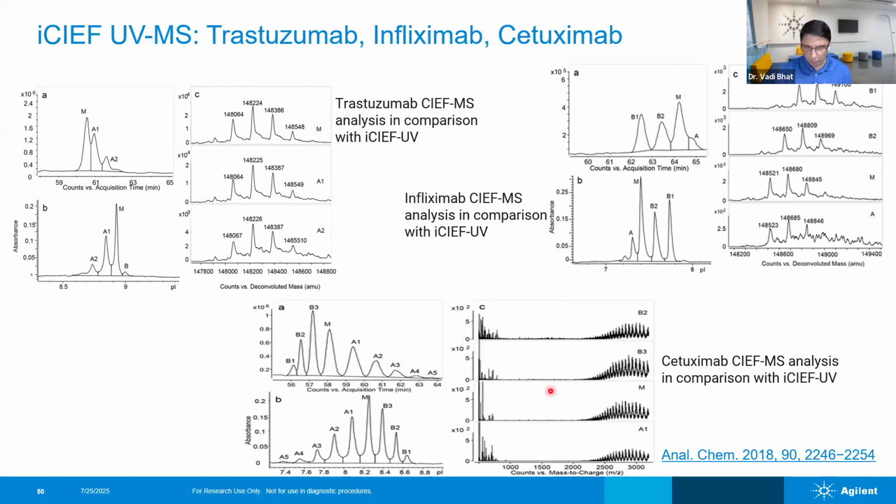So you can look into that for more details, how this analysis is done. Also, the CE mass spec is sometimes much more sensitive than the LC mass spec. It can be like your nanospray mass spec, and that is how sensitive mass spec can get.